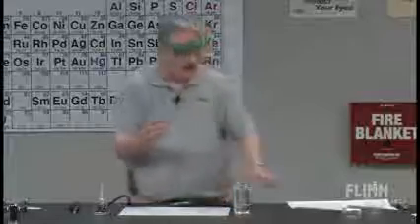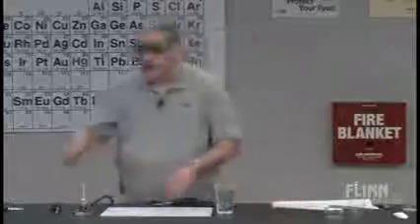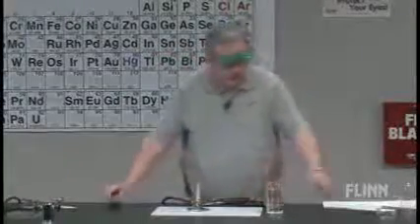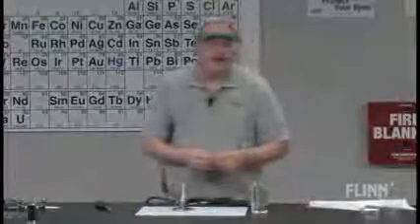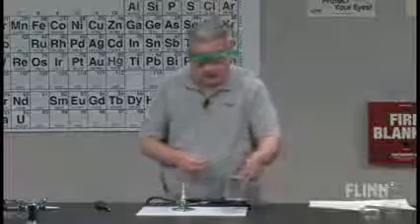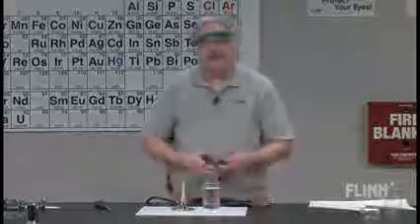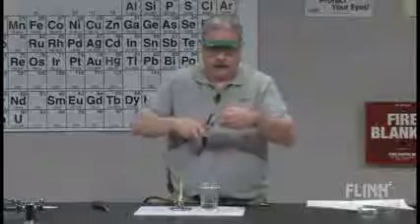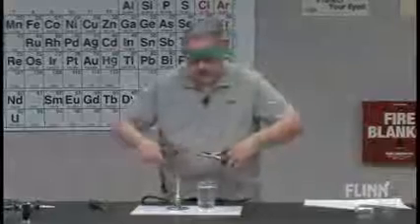So you could take this bobby pin, you could have a bobby pin for your standard or comparison, and you could try other properties or other techniques. Turning on the Bunsen burner flame again. Last one, we heated it to red hot, and then we let it cool slowly. And I'm going to put this right over here. Is that appropriate? And I'm going to this time cool it very quickly. I'm going to pull it apart a little and use the pliers. And we're going to quench it.